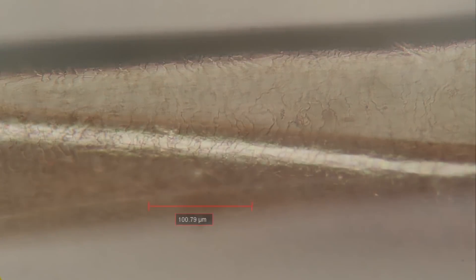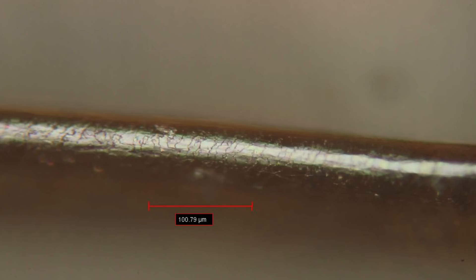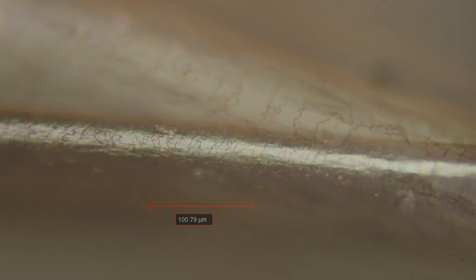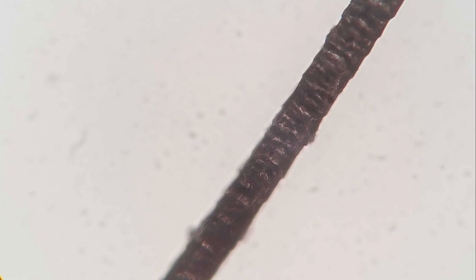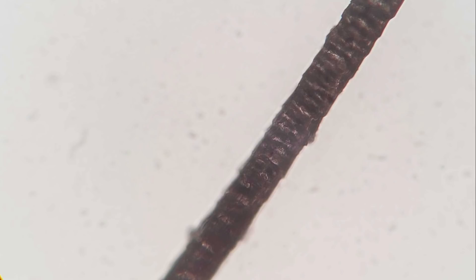Beaver guard hair looks very shiny as light reflects off it — it really looks quite oily. The scales on the surface of beaver fur are very tiny and layered with imbricate scales. Domestic cat hair has a very interesting medulla that's characteristic in structure — the cells inside look a little bit like a ladder. It also has some spiny scales on the cuticle and can be color banded, especially in tabby cat hair.